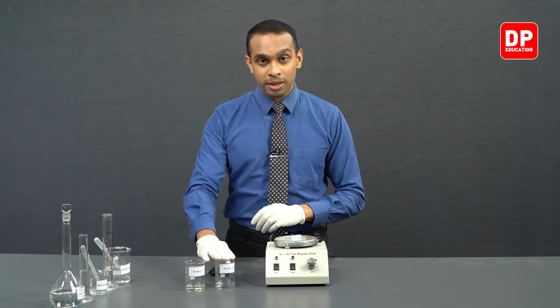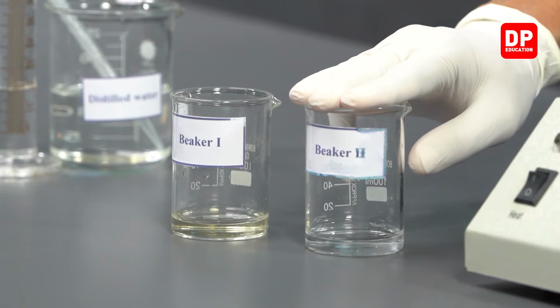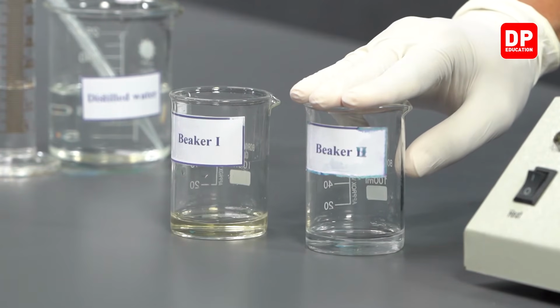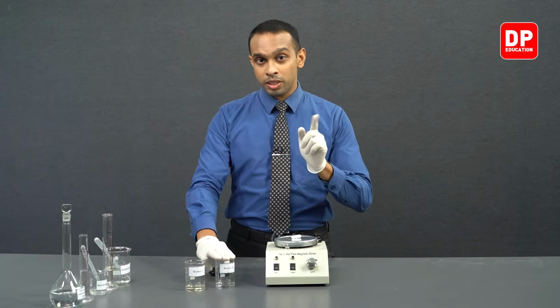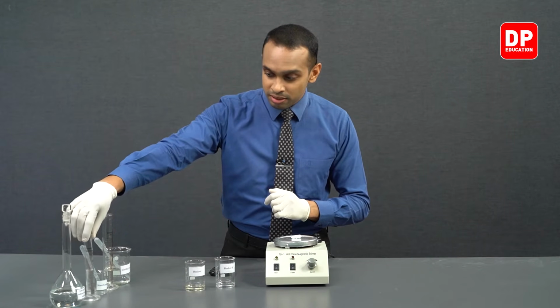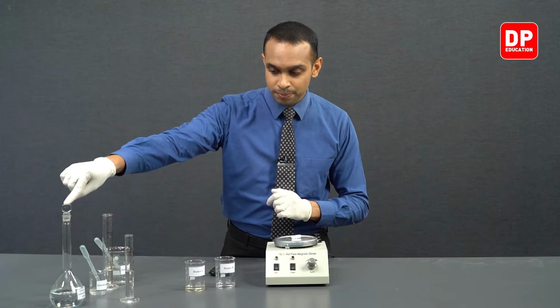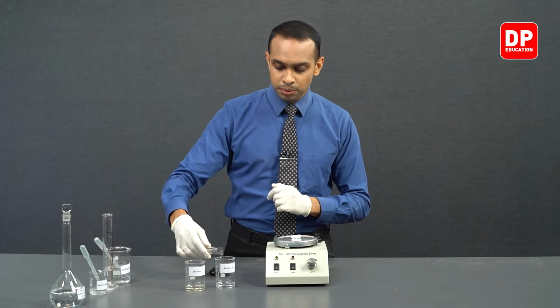And to beaker 2, like I mentioned in the third part of this experiment, we have taken only 10 cubic centimeters of potassium iodide solution. And the solution's concentration was 3.0 moles per decimeter cube. And we have measured 15 cubic centimeters of sodium thiosulfate, and we are going to add it to our beaker 2.